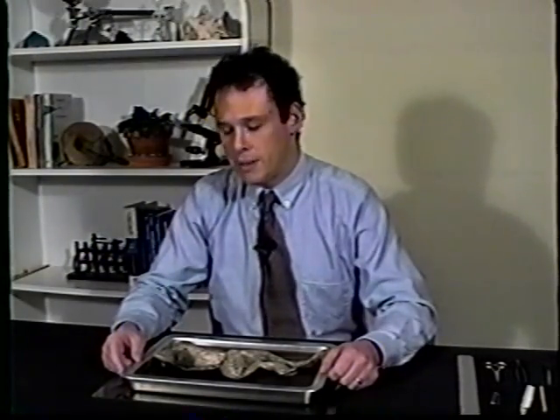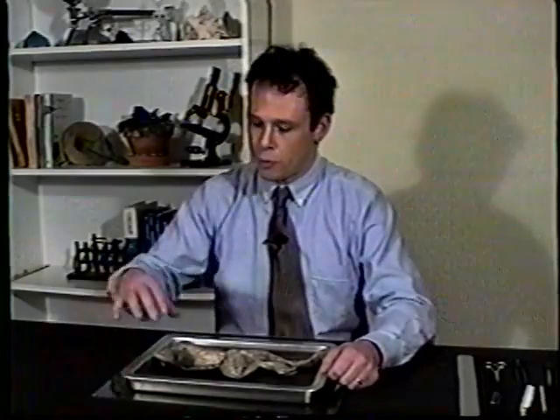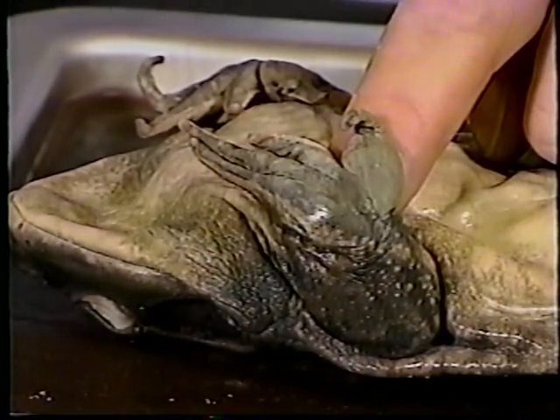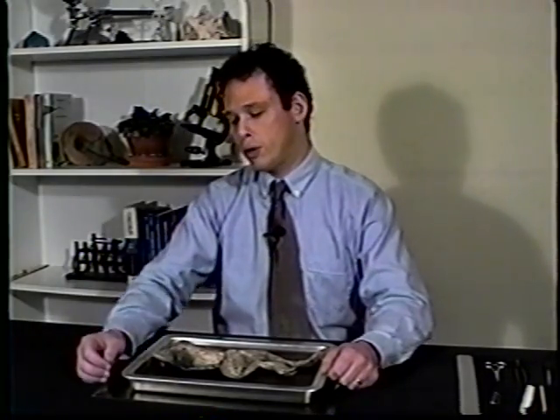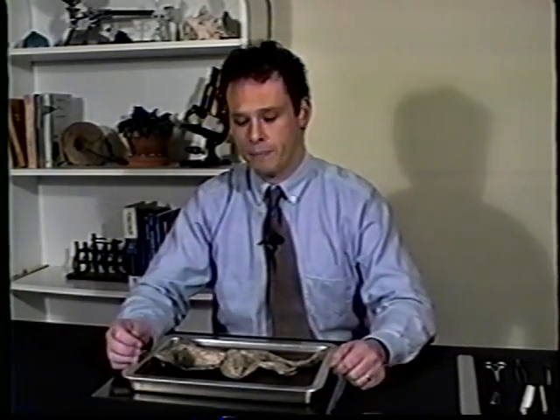We will now examine the legs of our specimen. As we compare the anterior legs to the posterior legs, we notice that this specimen has evolved specific uses for each. The short anterior legs allow the frog to do several things. They provide a safe landing after a long jump, and they are also conveniently located near the mouth for quick shovel-like feeding motions.